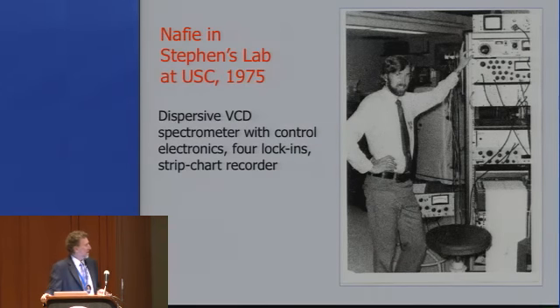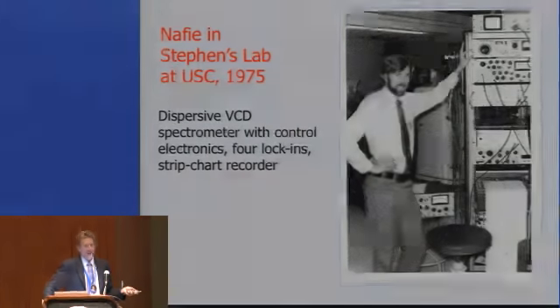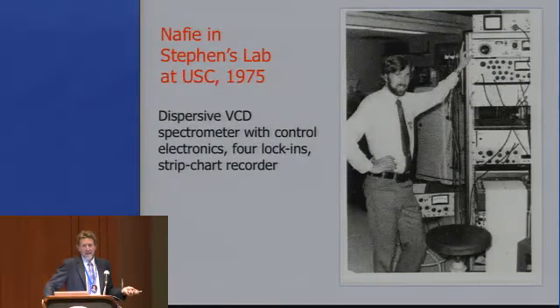After I got my position at Syracuse, we dressed me all up. But I wanted to show you all the lock-ins. This strip chart recorder is where the spectra came out. And that's it. Once that's been recorded, until you get it duplicated by an artist, that's all you have. And you have to be very careful. You have to make sure the ink doesn't run out.